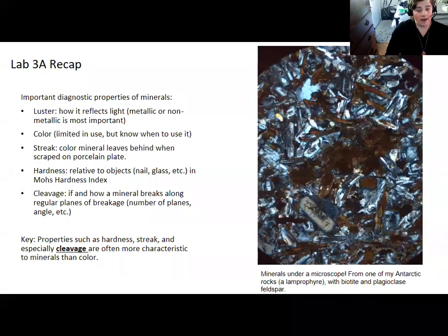Bananas have potassium, Jorge, actually. That's a very good guess. And I kind of see where you're getting at, because potassium is another element that can give minerals kind of a pinkish color. So I shouldn't say that pink is always only manganese, and the pink that you get from manganese is slightly different from the pink you get from potassium. But yes, Jorge, very good point on that.